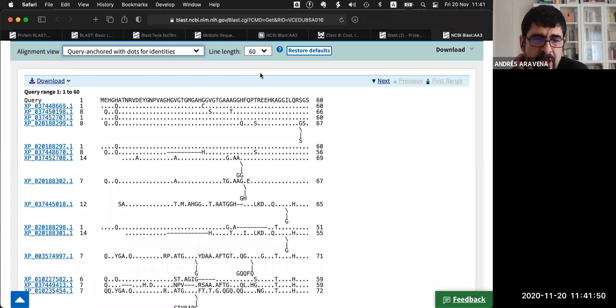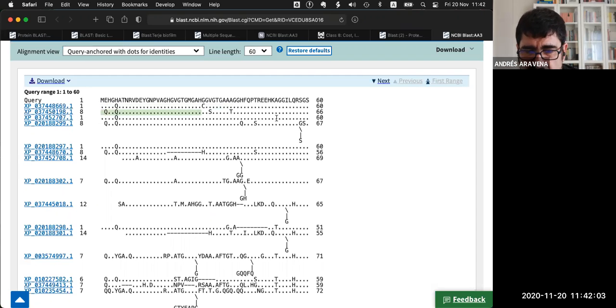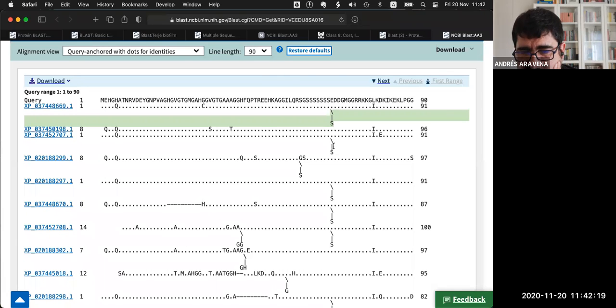This is interesting because it's showing, okay, this probably takes more time to explain, but here we have all the subjects together. This is the first, this is the second. Then make it a little longer here. And here they are trying to mark an insertion, so it gets kind of hard to see the big picture.